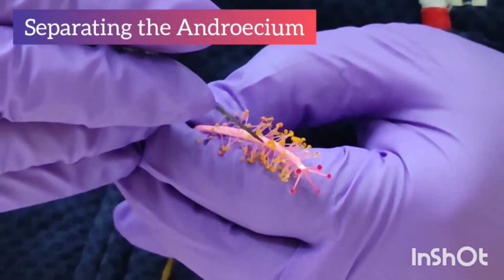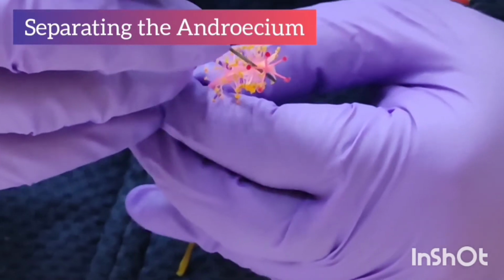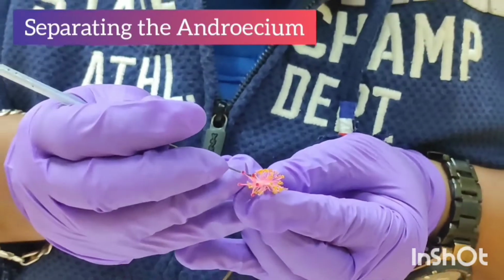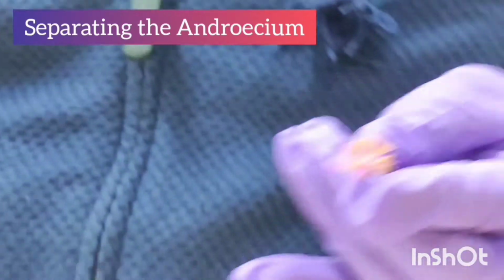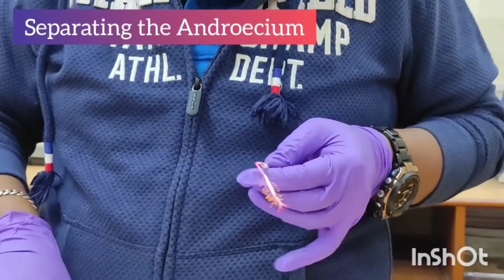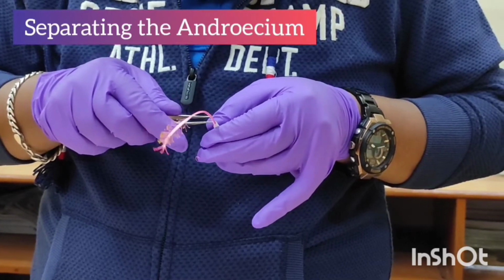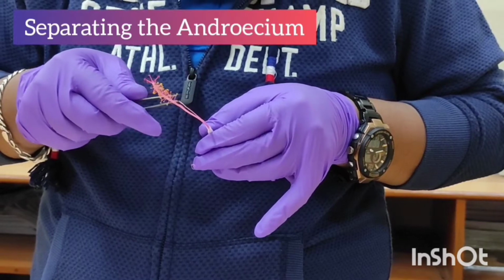Students, it is better to isolate the androecium as a whole, but in this case it is a very difficult job. You have to be very careful during this time so that the gynoecium remains intact.